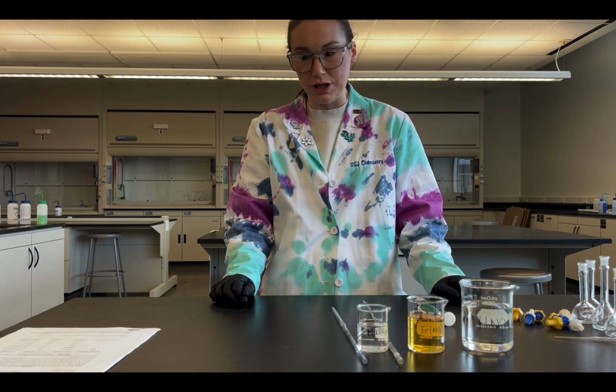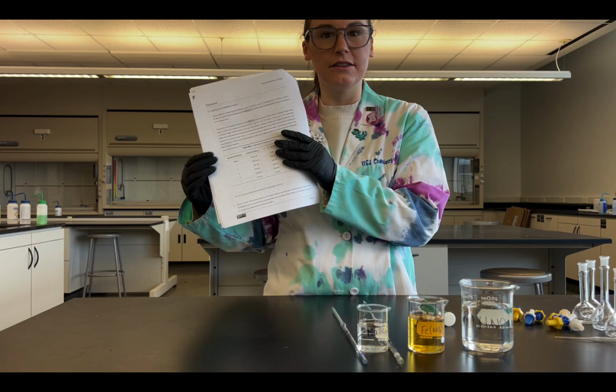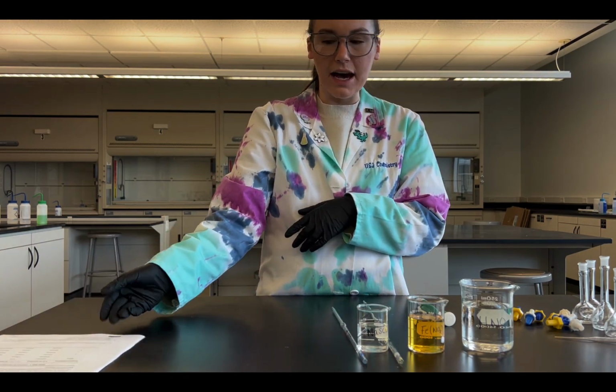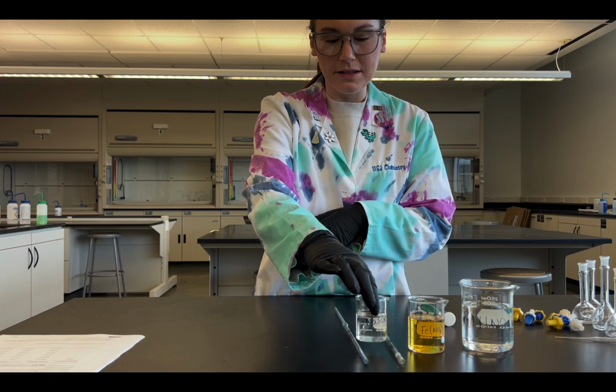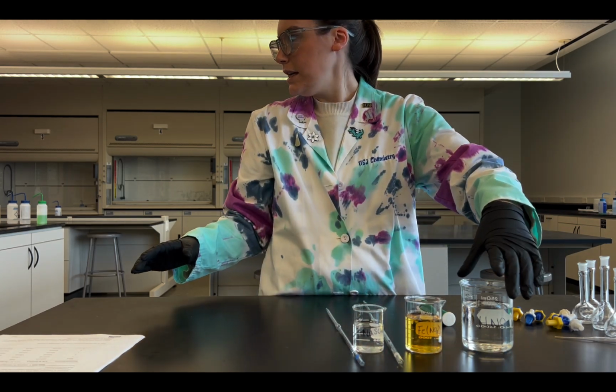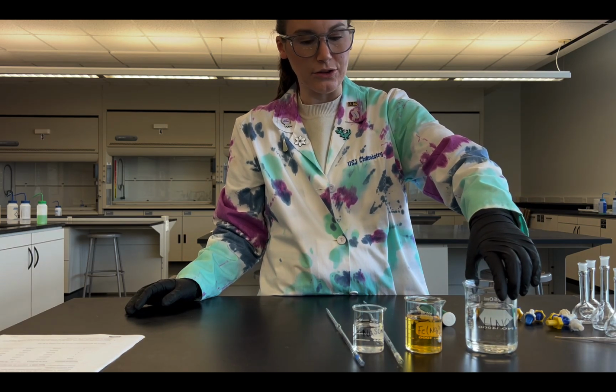Okay, so this is the part where we are doing our dilutions in order to make our standard solutions. So I have in front of me my table that has the different volumes that I need to use to make these solutions. I have my sodium thiocyanate, my iron nitrate, and my nitric acid that I'm going to use to dilute.